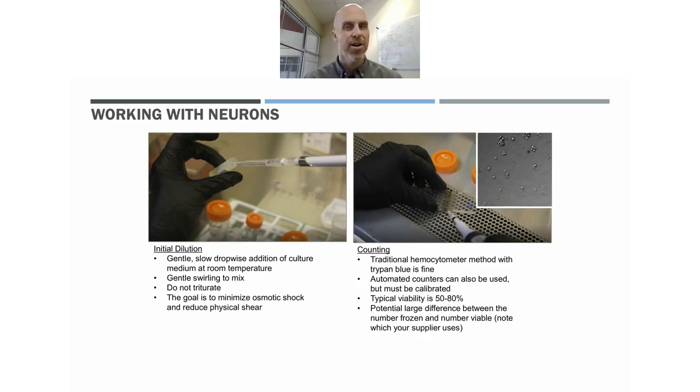And so, I had a customer recently say, "Oh, we only got 75% viability." And I said, "That's okay. That's a pretty good number, actually," versus, again, what people are maybe seeing from cell lines that they've worked with in the past.